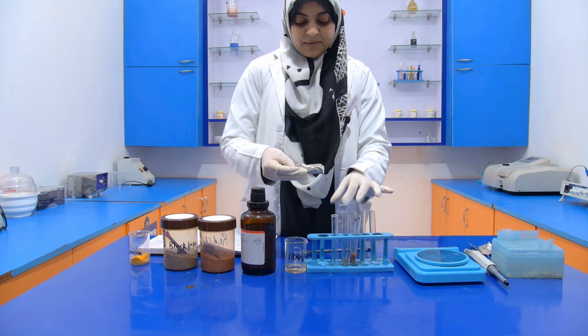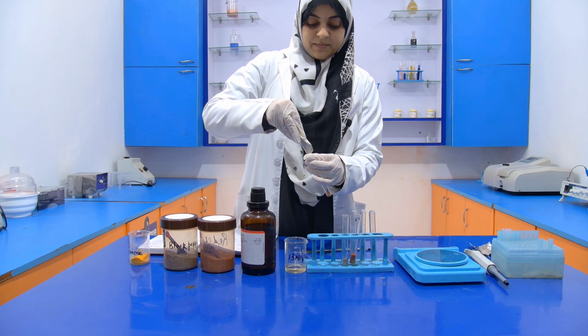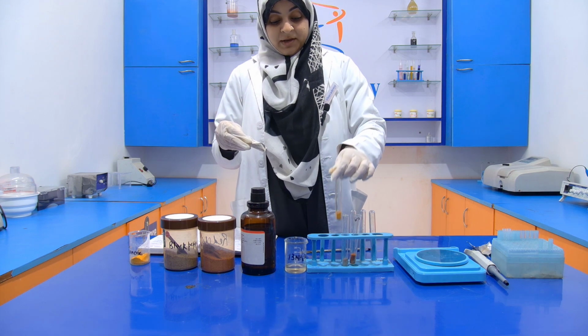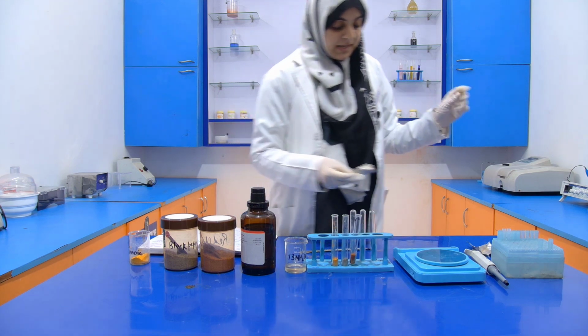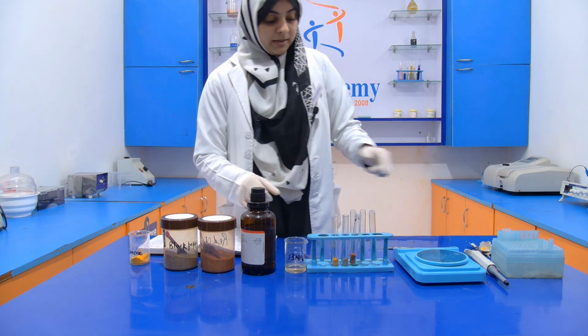After taking the sample, we have to add 3 ml of petroleum ether for the extraction. Which thing do we have to extract? If the coloring agent is there, then the petroleum ether extracts it.